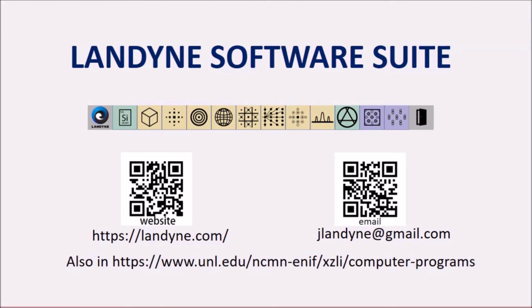The purpose of this video is to introduce the software JECP/HOLZ, a computer program for simulation of high-order Laue zone pattern, or briefly, HOLZ pattern. This is one of the components in the Landyne suite for electron diffraction simulation and crystallography analysis.